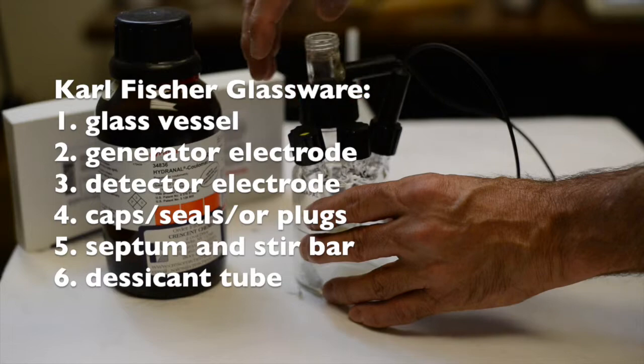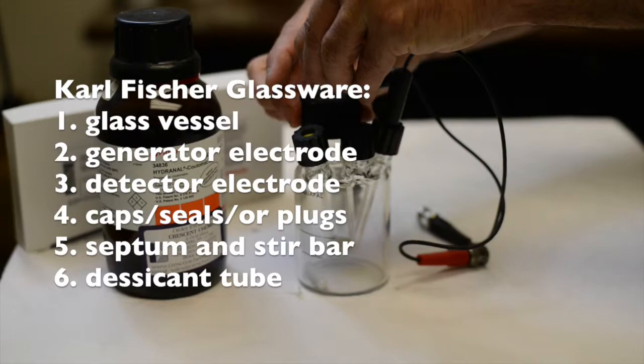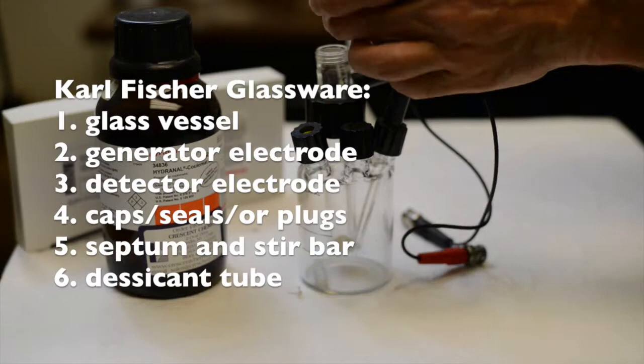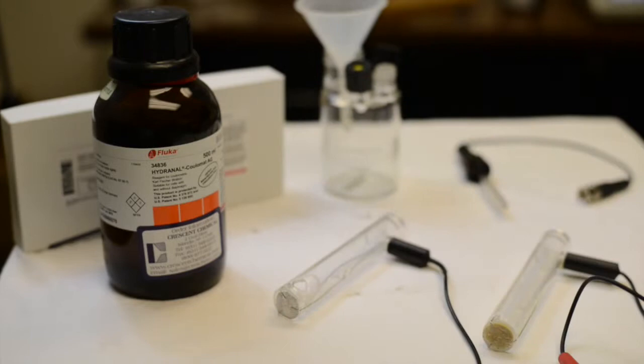Stir bars are placed in the bottom of the vessel and work in tandem with a magnetic stirrer to ensure that the sample and reagents mix sufficiently. And finally, desiccant tubes are used on various ports including the generator electrode to ensure moisture is kept out of the vessel.